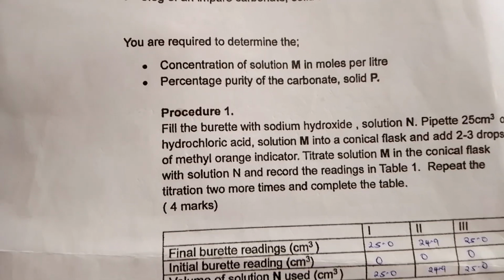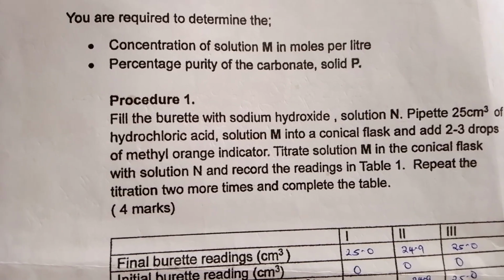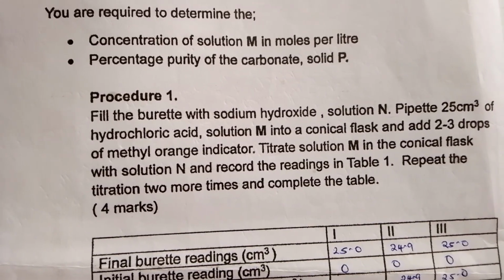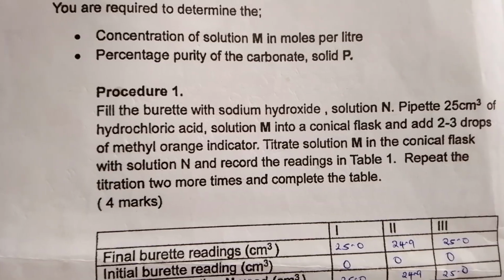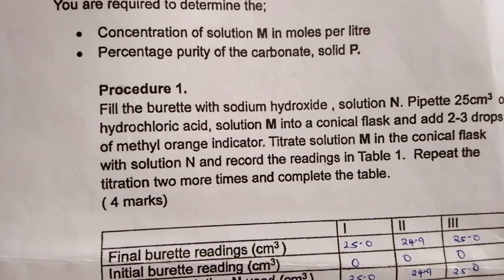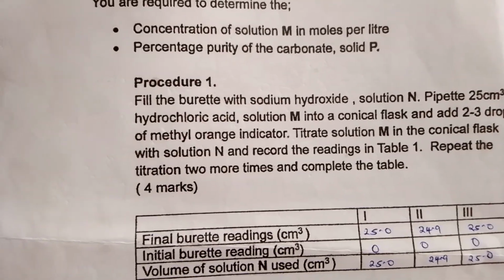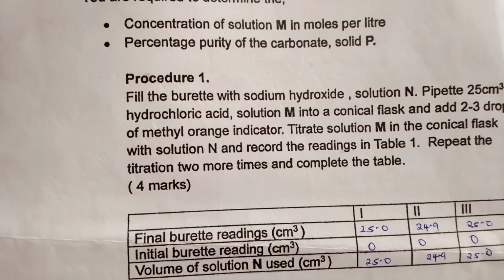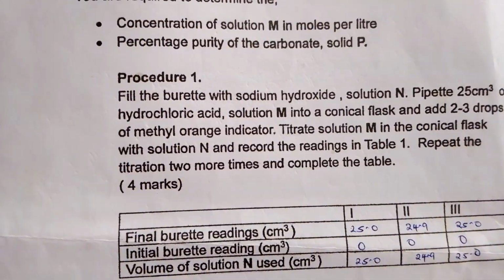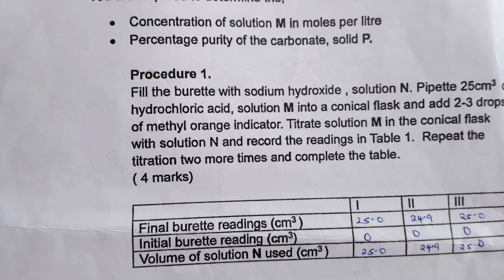Procedure: fill the burette with the sodium hydroxide solution, which is solution N, and then pipette 25 cubic centimeters of hydrochloric acid solution M into a conical flask and add 2 to 3 drops of methyl orange indicator. Titrate the solution M in the conical flask with solution N and record the readings in table 1. Then you repeat the titration 2 more times and complete the table.